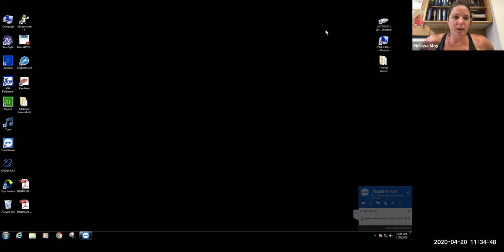Hi, so we're going to go through how to use the software programs that are designed to run the Q Exactive Plus and the associated LC, which is the Ultimate 3000. There are two separate software programs that are used, but they are connected to one another. This is showing you the desktop of the computer that runs the mass spec in Baker 464.